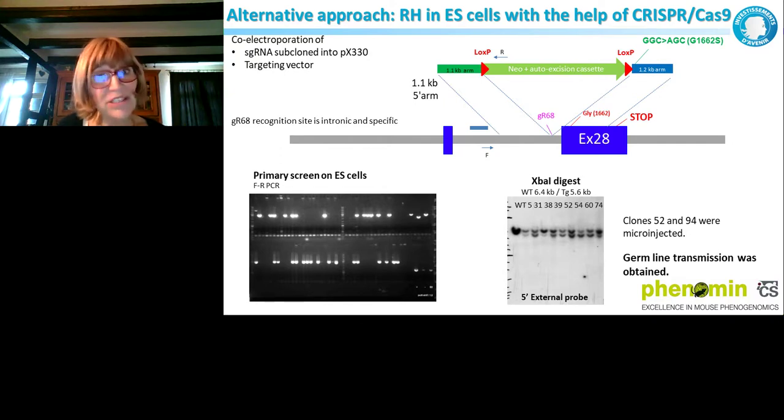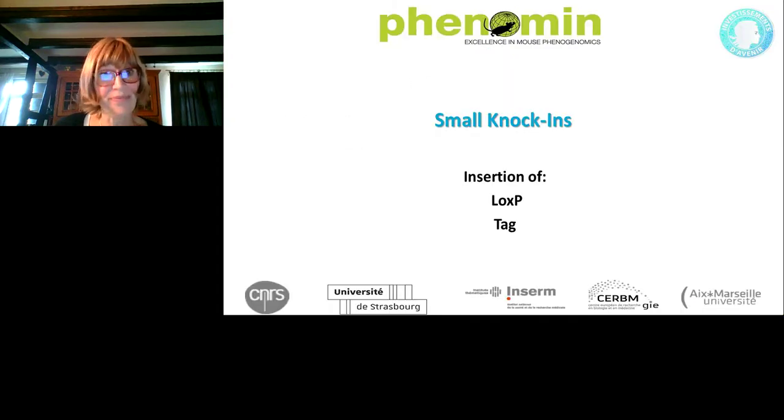Then we spent a little bit of time with CRISPR, but sometimes ES cells are still the correct way, because you can take a different approach with other constructs than just single-stranded oligonucleotides, because sometimes that's not possible and you have no guides that are specific enough. In this case, we are completely sure that everything is fine, that we are at the correct allele, and that you haven't targeted the SCN5A allele. And I think ES cells with CRISPR is really a nice tool to still have.